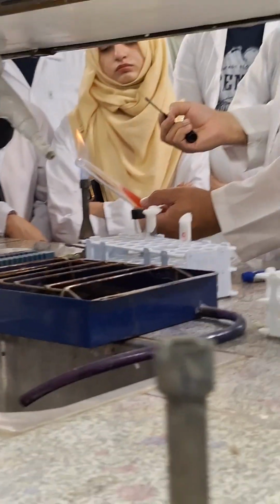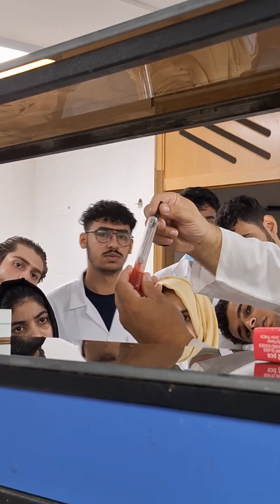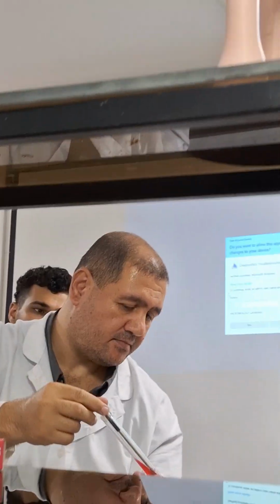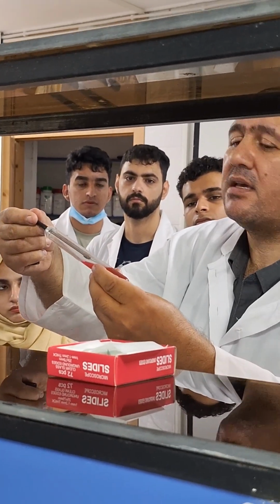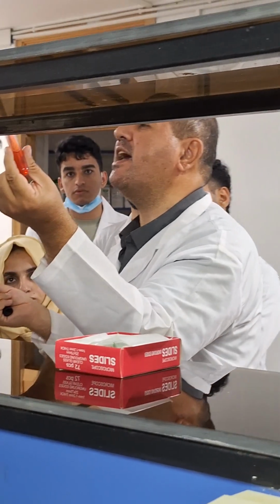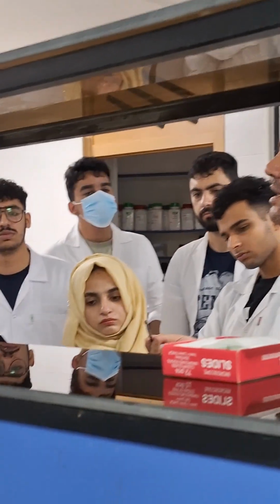Hold the cap of the tube in your hand. Don't place it on the bench. Sterilize the neck of the tube like this. And then, first, insert your needle in the bottom of a slant medium, like this. Yes? Clear? Then, in the slant area, culture in a zigzag. Okay? The name of the method is fish-tail method for a slant.